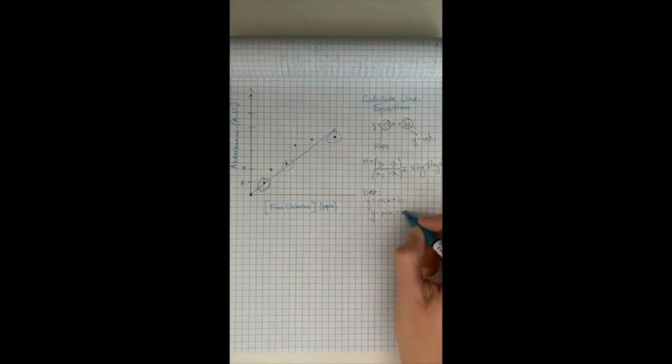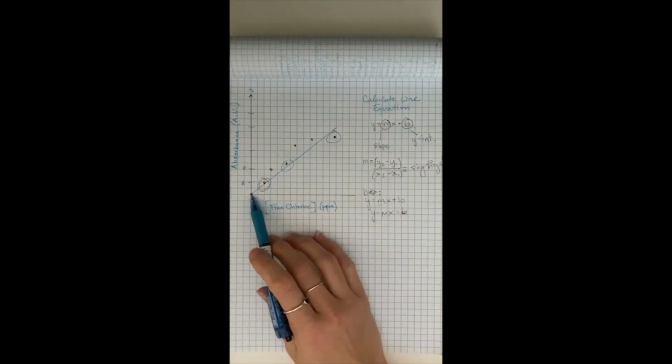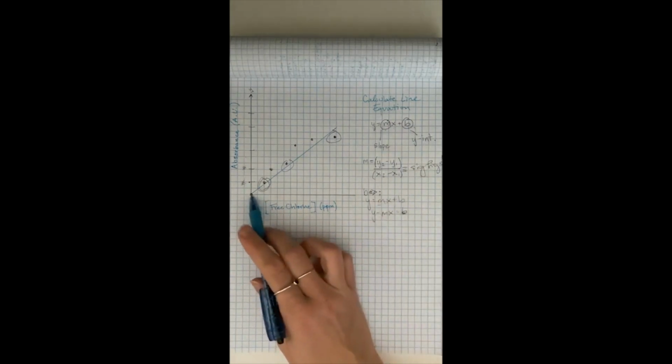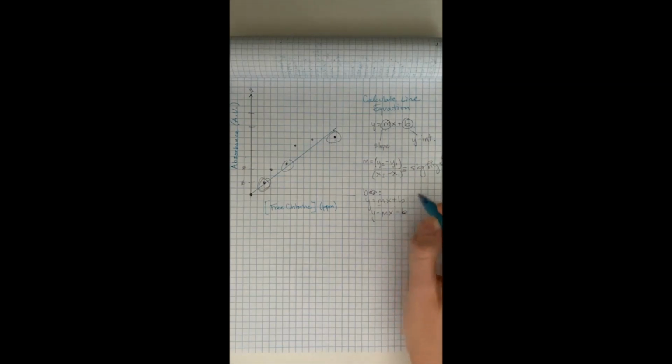So now what we can do is, knowing that this is when the line is crossed, we're going to plug in, because saying it crosses the y-intercept is also saying what is the value of y when x is 0. So we can plug in the x value, the slope value, but it's just going to equal 0 anyway in this case. So in this case, whatever our blank was is equal to b. So in this case, that was 0.000 AU is equal to b.